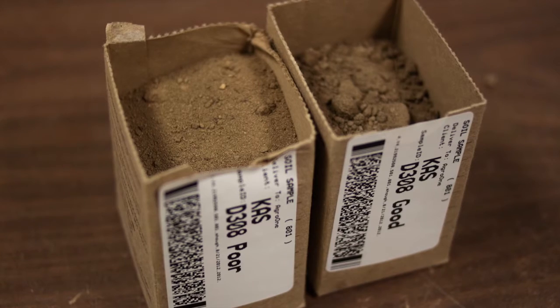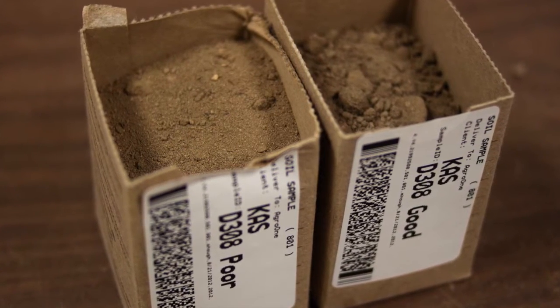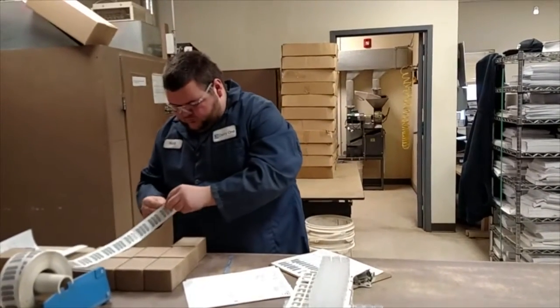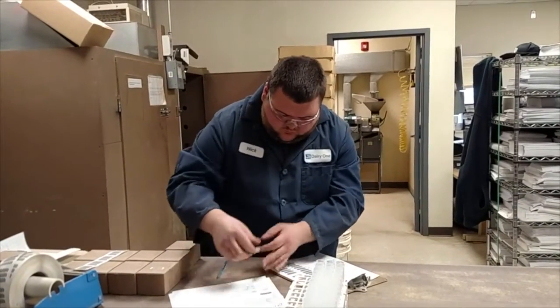Once we have the samples, technicians use an automated labeling process that allows the sample information to get scanned in at the lab. We'll see later how this process makes the data more accessible in the ACS advising software and also in the fields and crops record-keeping software.